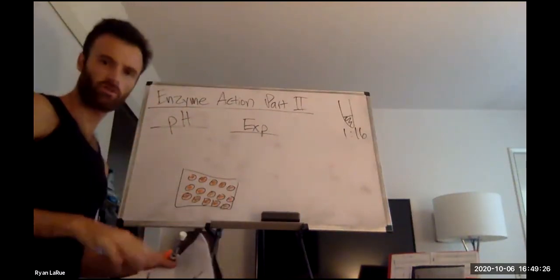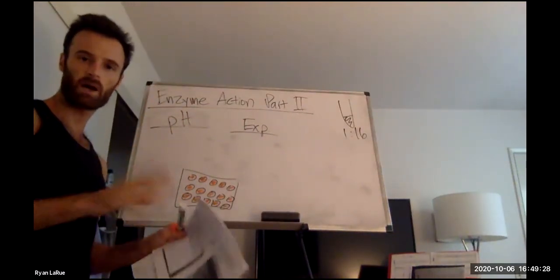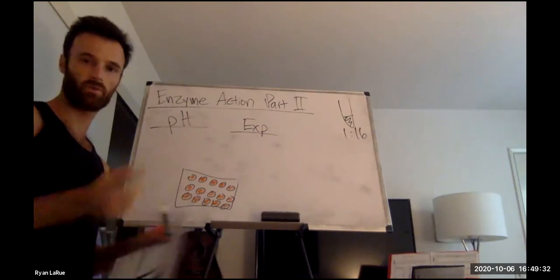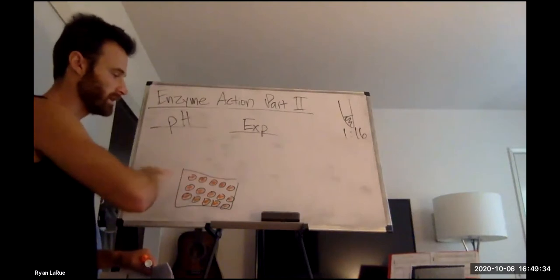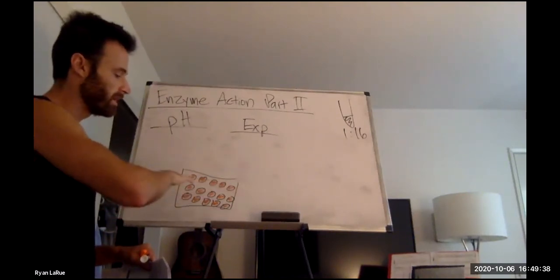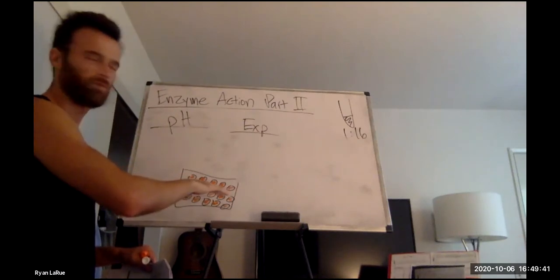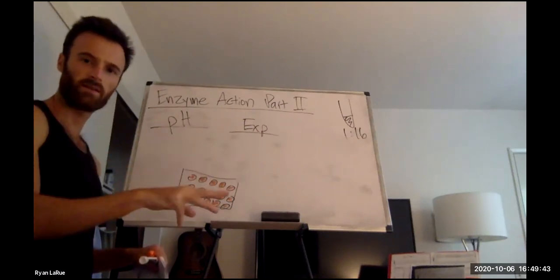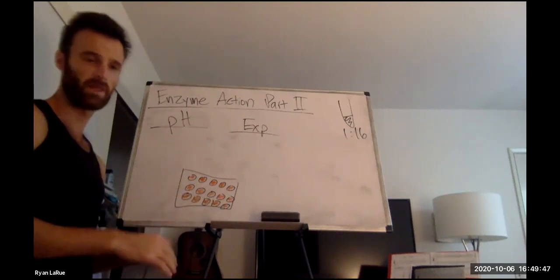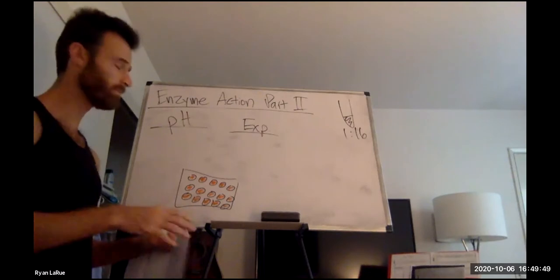So I'm not going to do the controls again, but you'd have the same positive and negative controls with water and then just your optimal saliva. You expect to see all blue-black for the negative control. And then between, I believe, 4 to 10, you'd see the 3 consecutive no color change in the wells for your positive control, where you have starch and your enzyme.